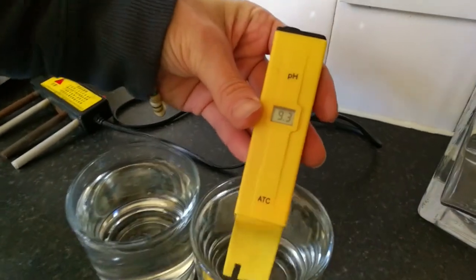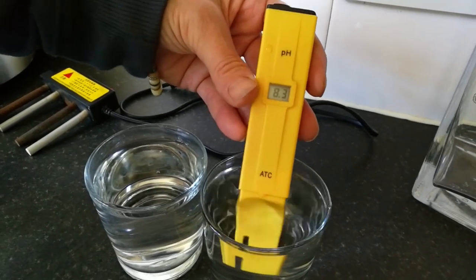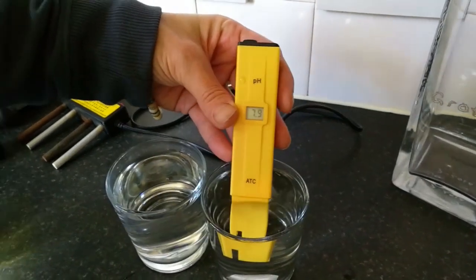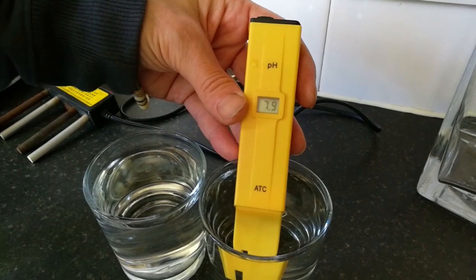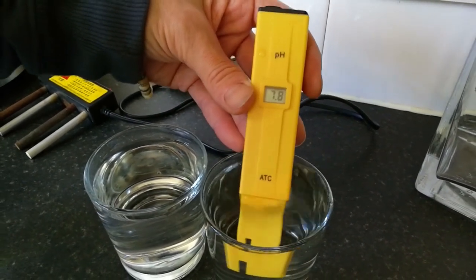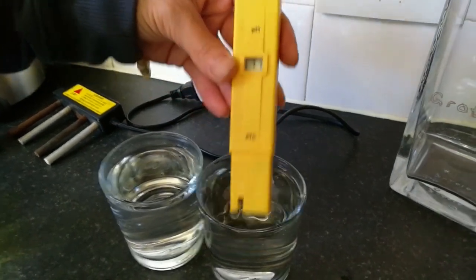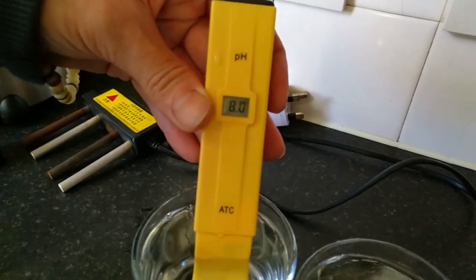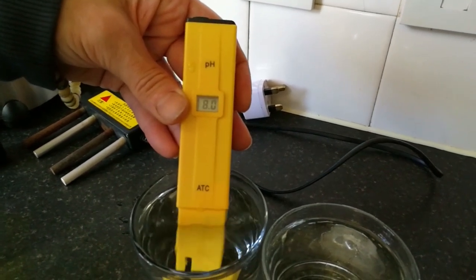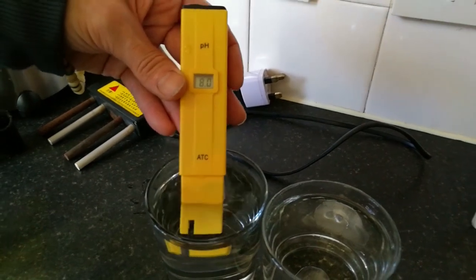Now the pH reader — it was between 7-point-something and 8 last time, so it takes a while to settle down. Anything over 8.6 is no good, so anything above 7 is really what we want. It'll probably settle down a little bit lower, but that's fine — it's nicely in the alkaline range, which is good. Tap water is usually about 8.5. Remember, tap water is quite good for pH because they won't give you acidic water, though it can have heavy metals.